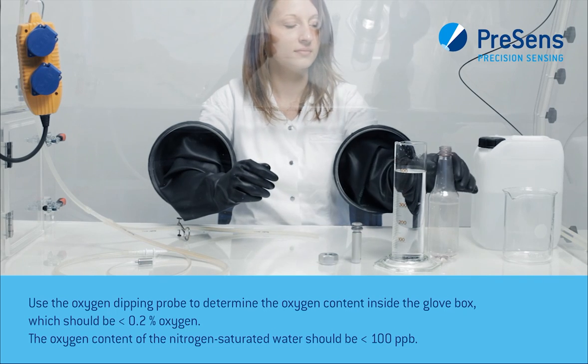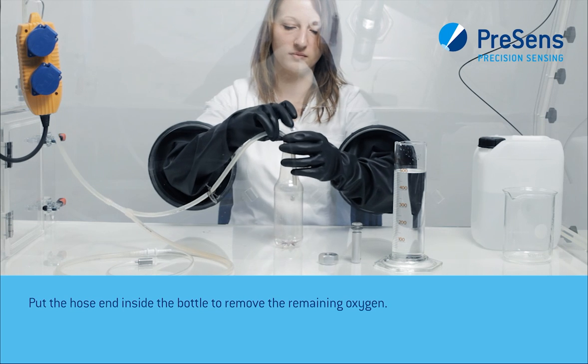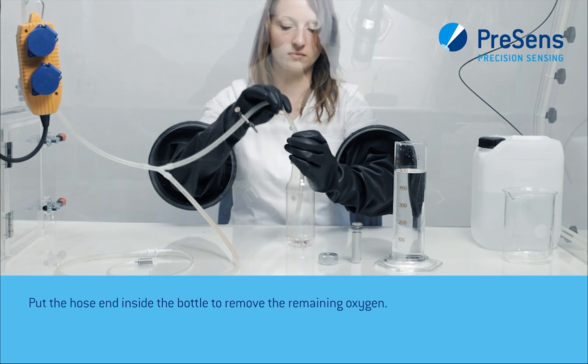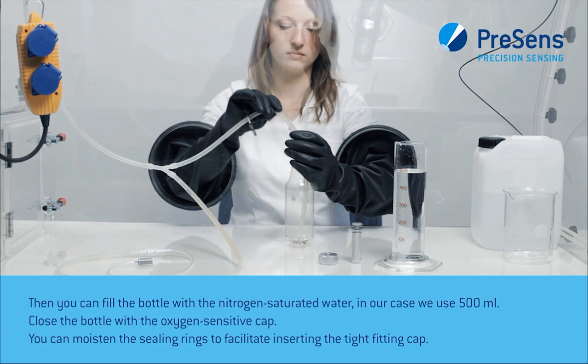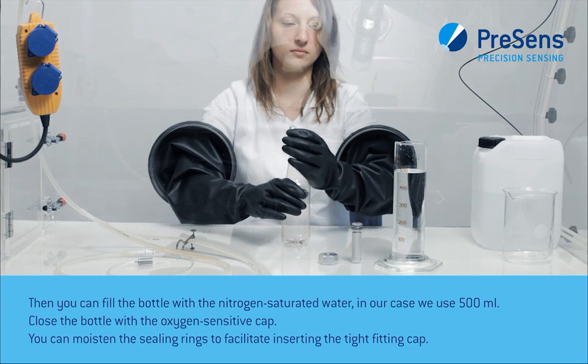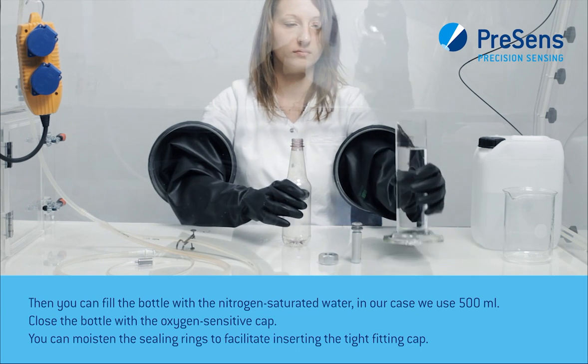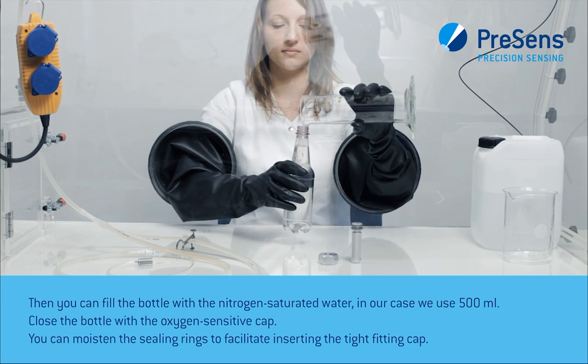Put the hose end inside the bottle to remove the remaining oxygen. Then you can fill the bottle with the nitrogen-saturated water. In our case we use 500 milliliters.